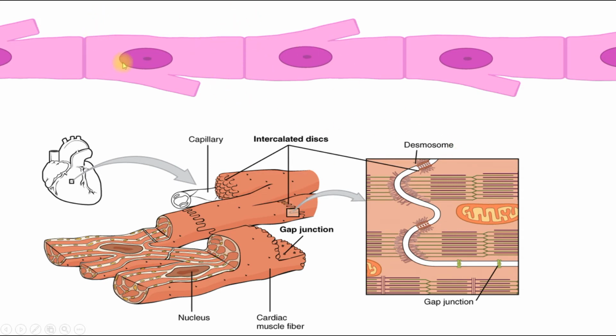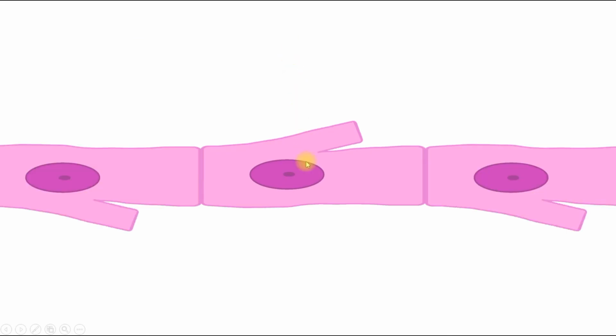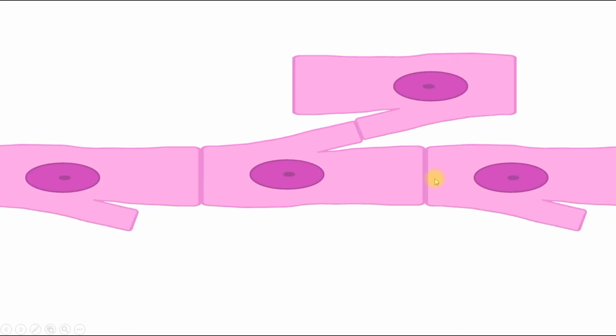Nervous signal is distributed via gap junctions of neighboring cardiac myocytes. And cardiac myocytes form anastomosis and branching structure of the myocardium. Here we can see intercalated discs, and also there are anastomoses of the neighboring cardiac myocytes. Here we can see cardiac myocytes in neighboring rows.